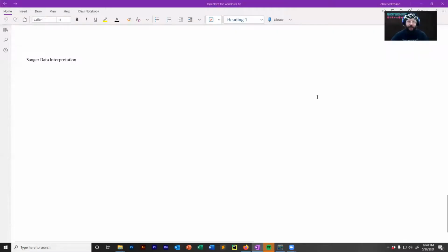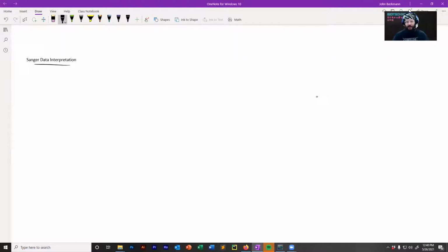Okay, recording. So I want to train about Sanger data interpretation here. If you're watching this video online and you're not in the room right now, the context would be perhaps you have had a plasmid that you just built and you sequence the plasmid, or perhaps you're doing some experiment and you need to do a Sanger sequencing reaction. So if you need to know about Sanger sequencing, go back, watch those other videos.